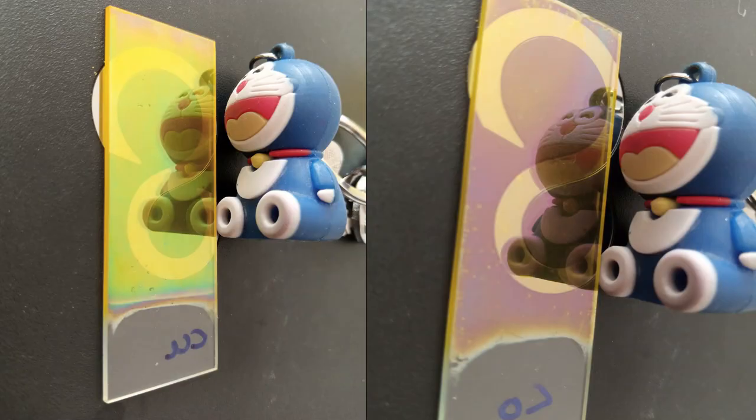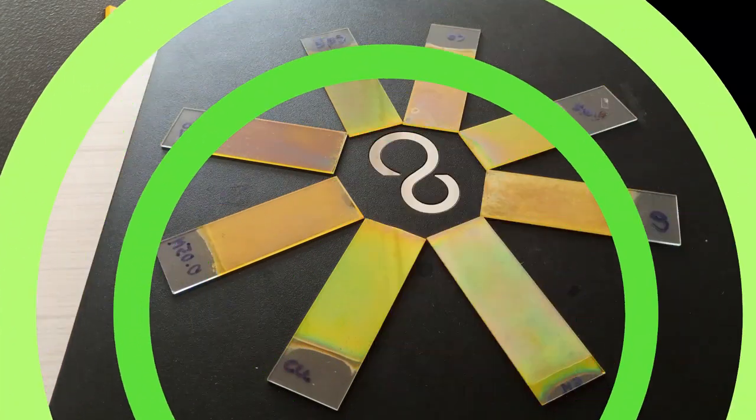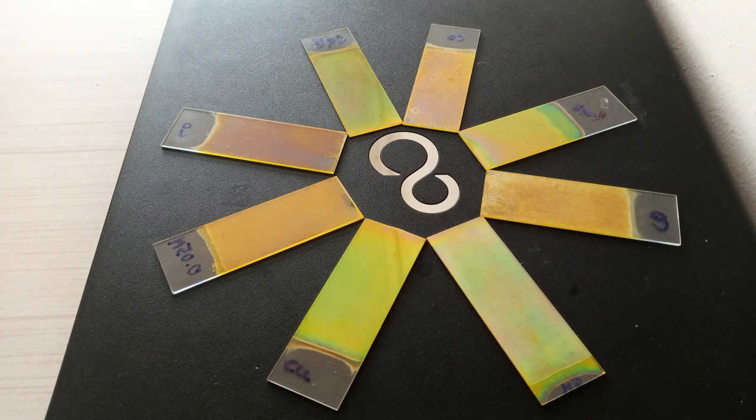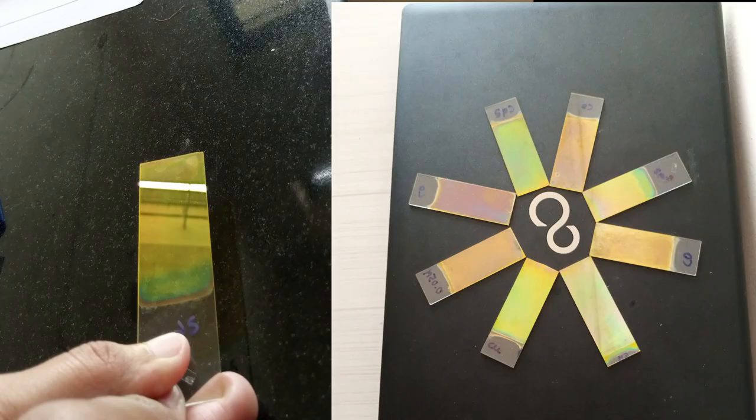As such, CdS is a yellow thin film whereas copper doped thin film has a little bit of greenish blue color and cobalt doped shows somewhat reddish color on the yellow thin film. Also, we have found that when we dope CdS, we are getting comparatively better uniformity of the thin films.